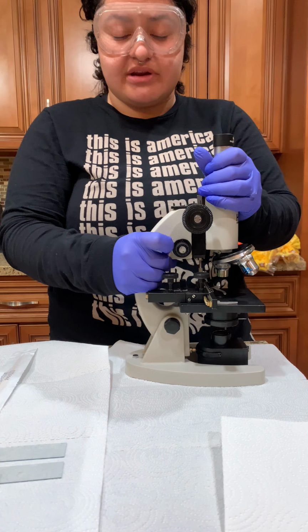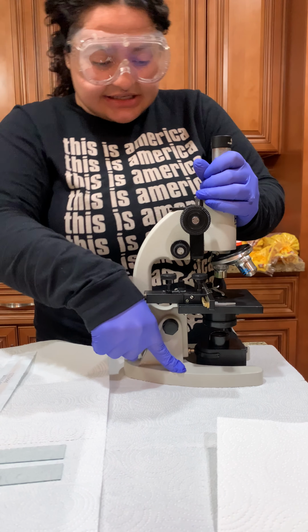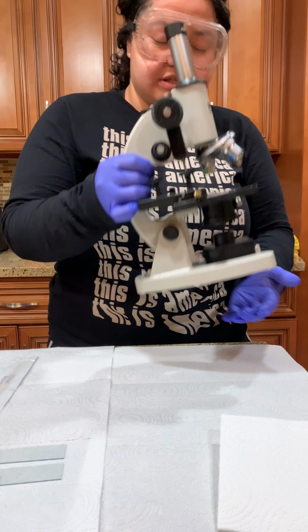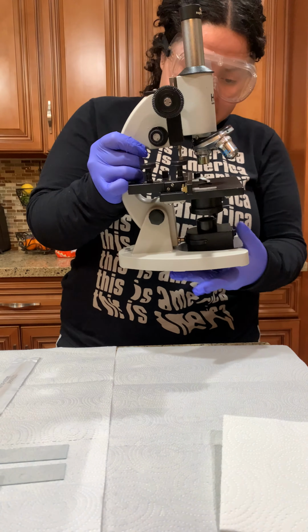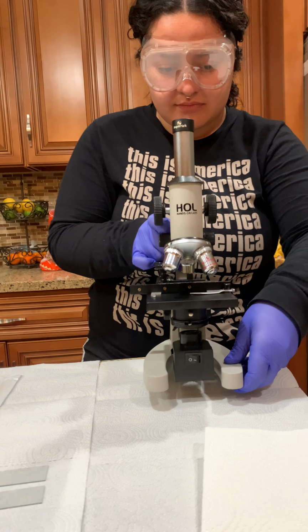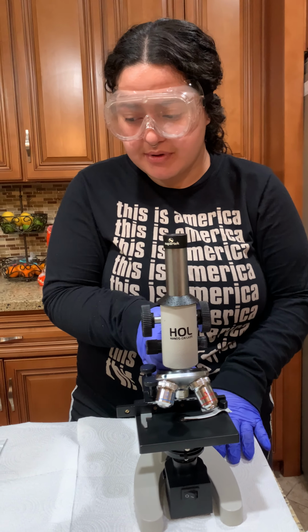Right here is the arm, pretty much where you hold on to the microscope. And then down here is the base, the bottom portion. So you're always going to carry one hand on the base and one hand on the arm. And then let's see. I think that's all the areas for the microscope.